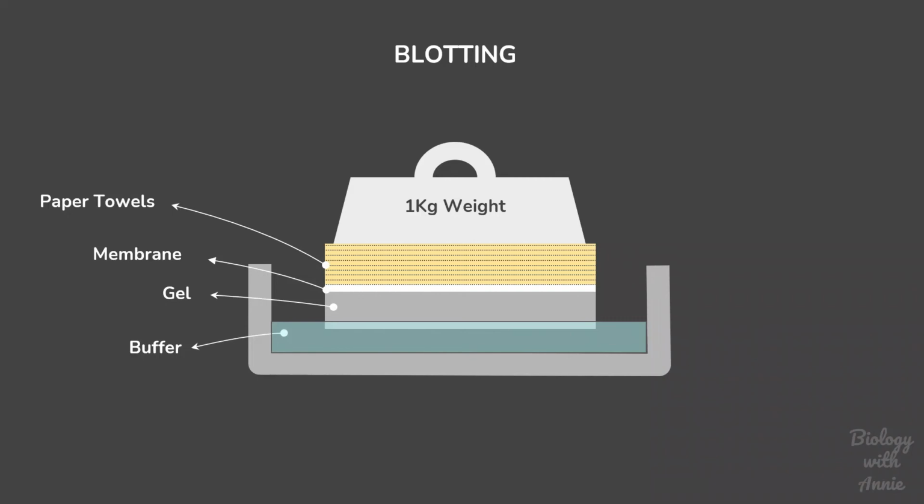So the gel is placed in this setup overnight, during which the dry paper towels will draw the buffer solution through the gel and the membrane due to capillary action. The suction of the buffer through the gel and the membrane causes the DNA molecules to travel from the gel to the membrane. In other words, the DNA is blotted onto the membrane.